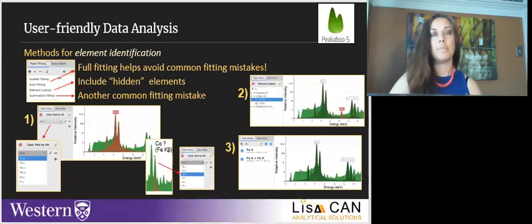The fitting of XRF spectra is a scary prospect. There are so many peaks. Some are for different elements, some are for the same element. How does anyone know? The usual answer: look them up in a table. Well, that's fine when you're an expert, and even then, mistakes are made. Peakaboo has 4 methods: guided fitting, auto-fitting, element lookup, and summation fitting.